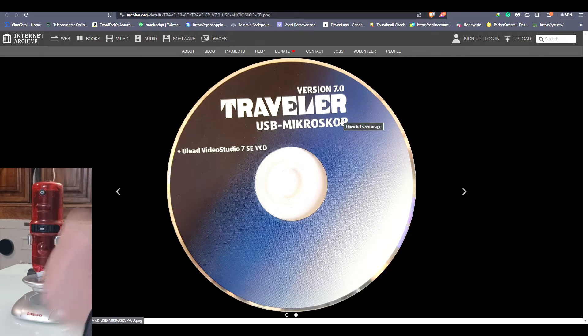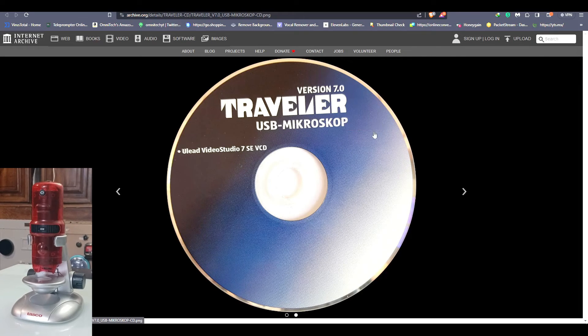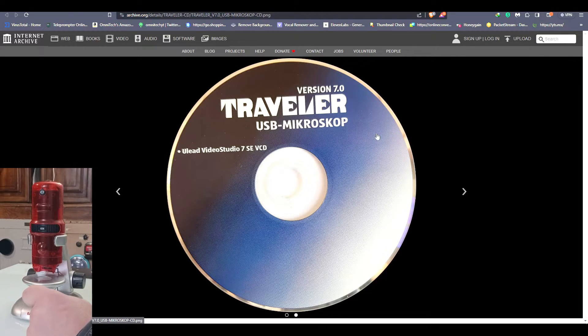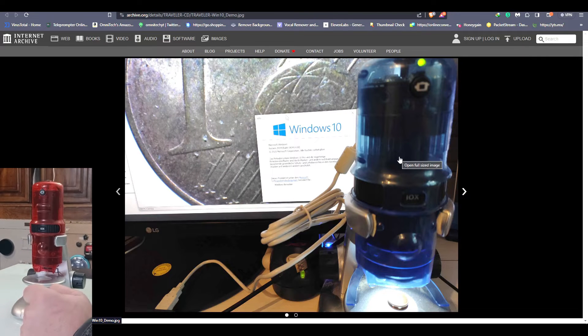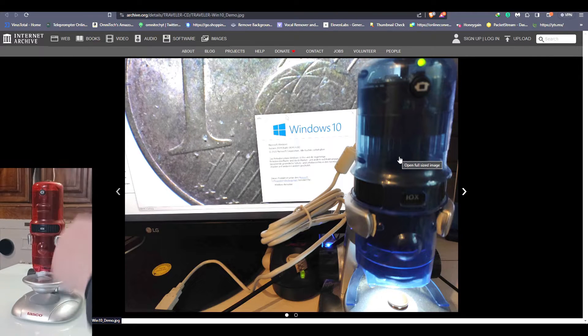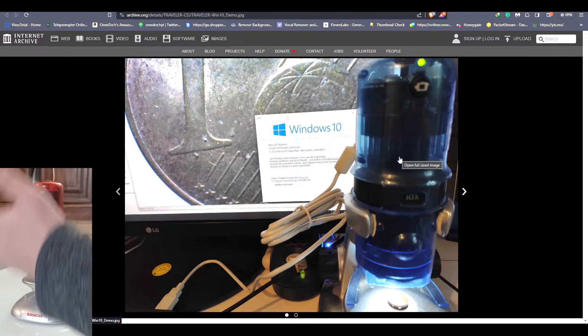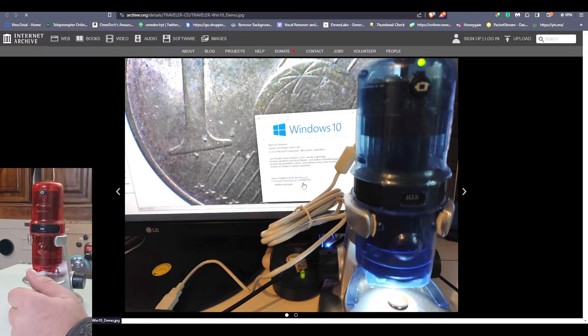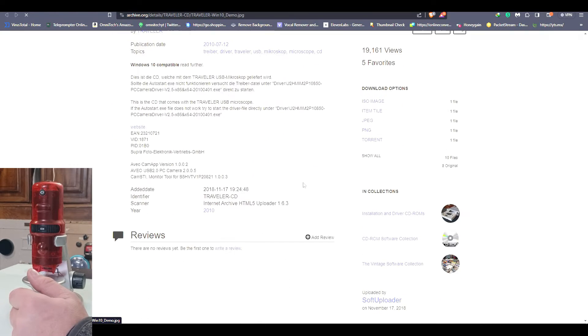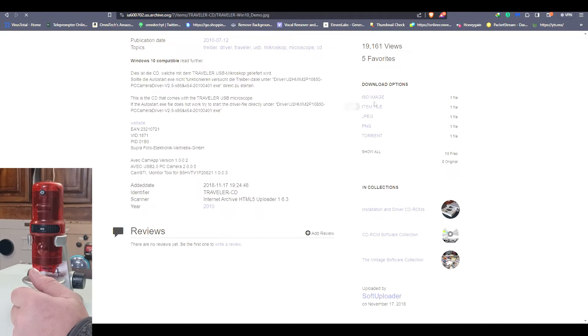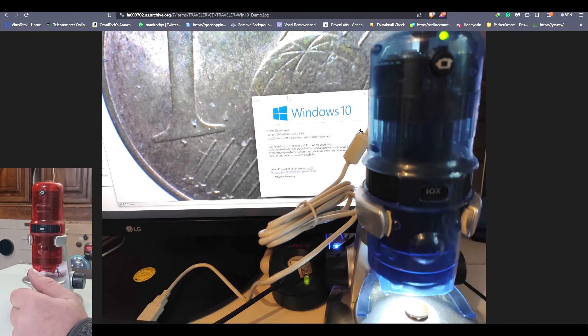The traveler version 7, the USB microscope, German looks like. That's the Avio Cheetah. Whoever posted this had the blue version, but that doesn't matter because all we need here is the file.